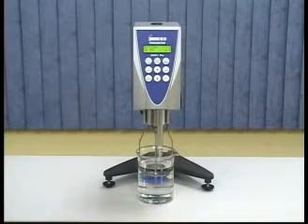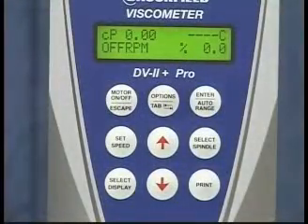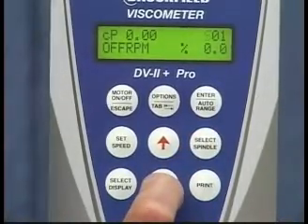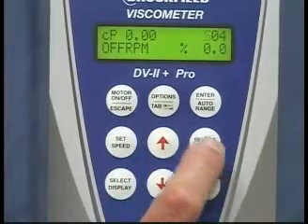Now that you have attached the spindle, a spindle entry code must be entered. You will find the codes for all spindles in an appendix in your manual. To enter the spindle entry code, push the select spindle button, scroll using the up-down arrows to the correct spindle code, and push the select spindle button again to lock in the code.